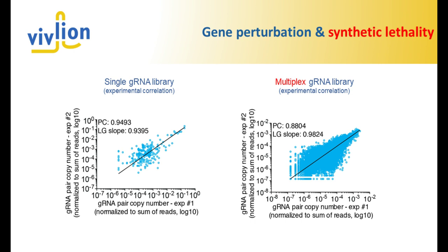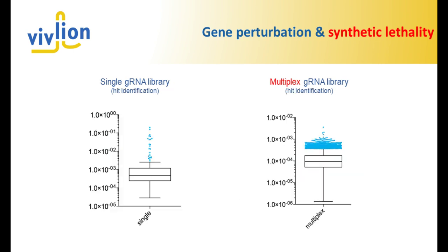We then, of course, apply computational analysis, and we do outlier analysis to basically perform hit calling. And when we do that, what we see here is that roughly 20 genes, and those are shown here on the left side in blue, have a phenotype in single conditions.